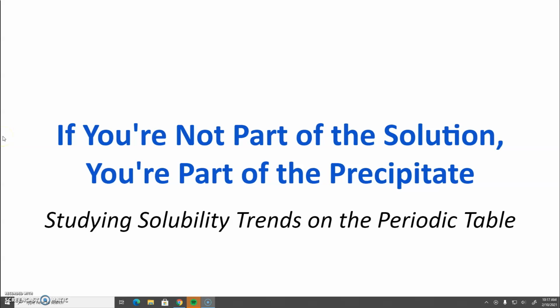All right, we are going to talk about our next lab, which is entitled, If You're Not Part of the Solution, You're Part of the Precipitate, and we are studying solubility trends on the periodic table. So just like we can study the trend in atomic radius, the trend in ionization energy, and the trend in electronegativity, there are other properties that have trends as well, and one of those is solubility, and that's what we're going to be looking at in this lab.